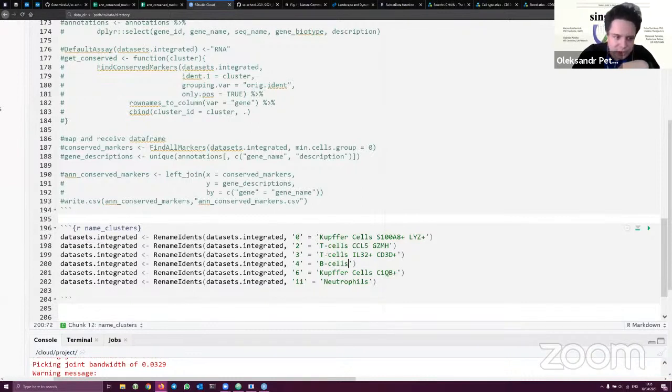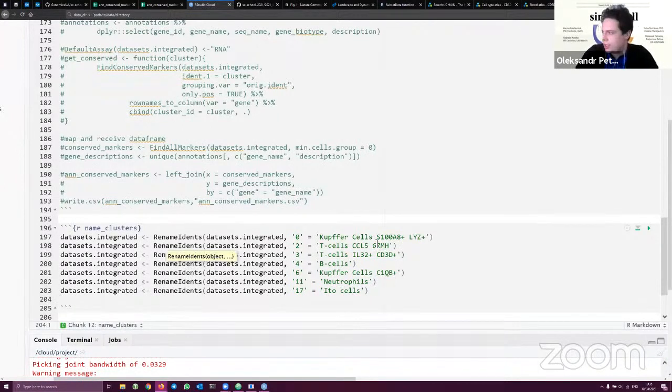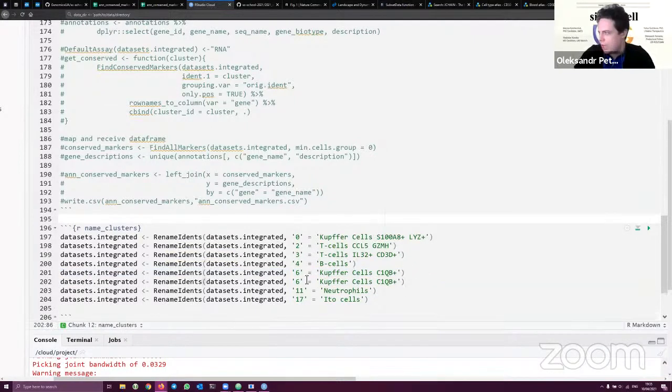Let's move on without further delay, and we will just mark those you already sent to us. And okay, cluster 7 is mesenchymal cells. That's a good observation. That's very, very likely true. I remember something about this. These are liver-specific cells, but not immune cells. Cluster 8 is cholangiocytes, another cell type. And we will finish with the last one you just saw. And this is again another marker.